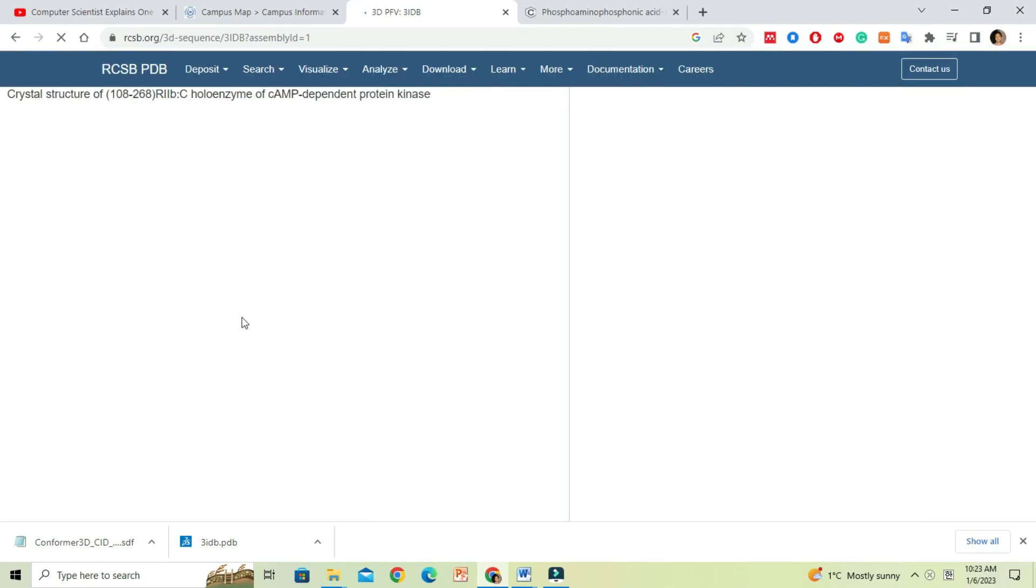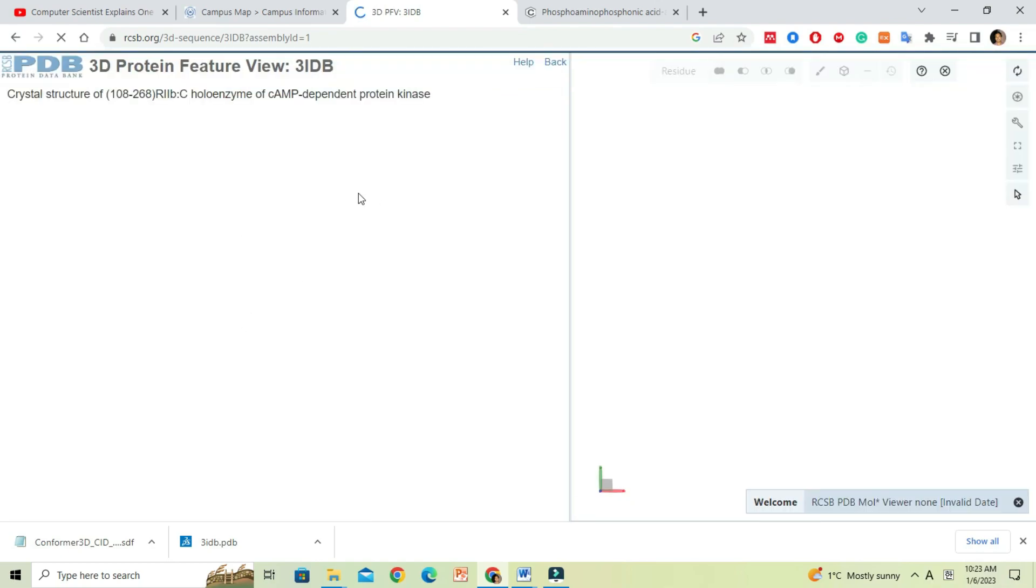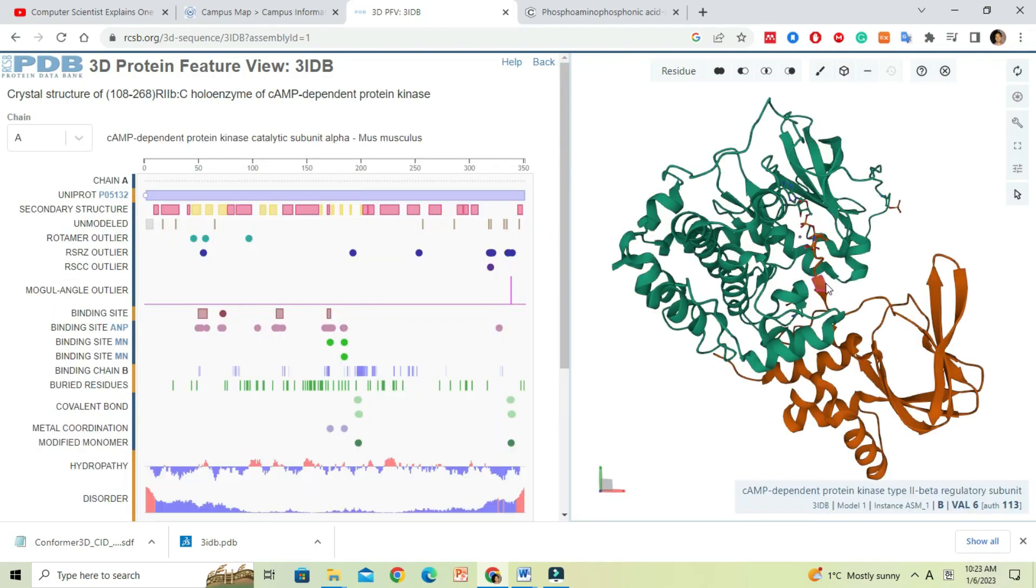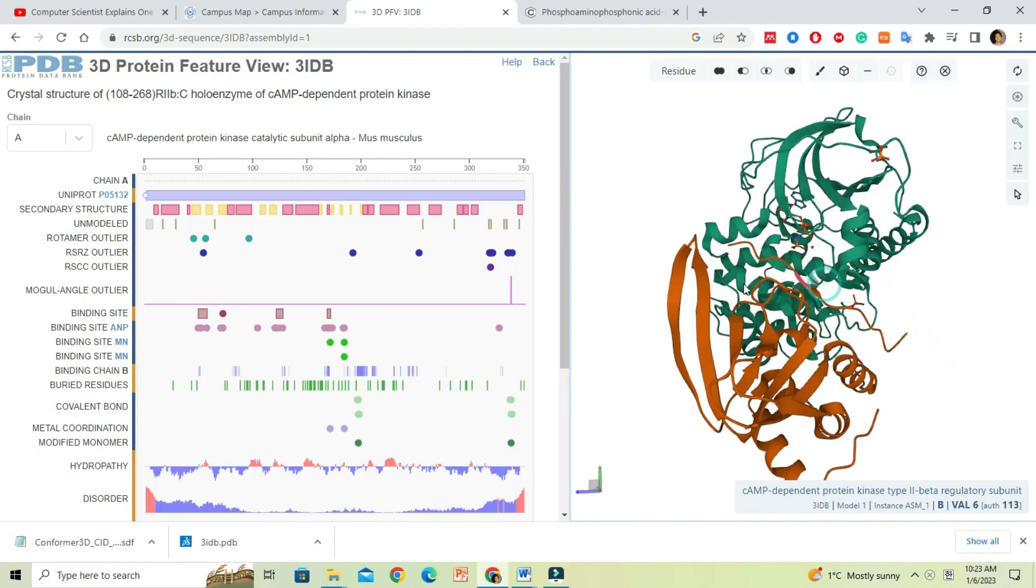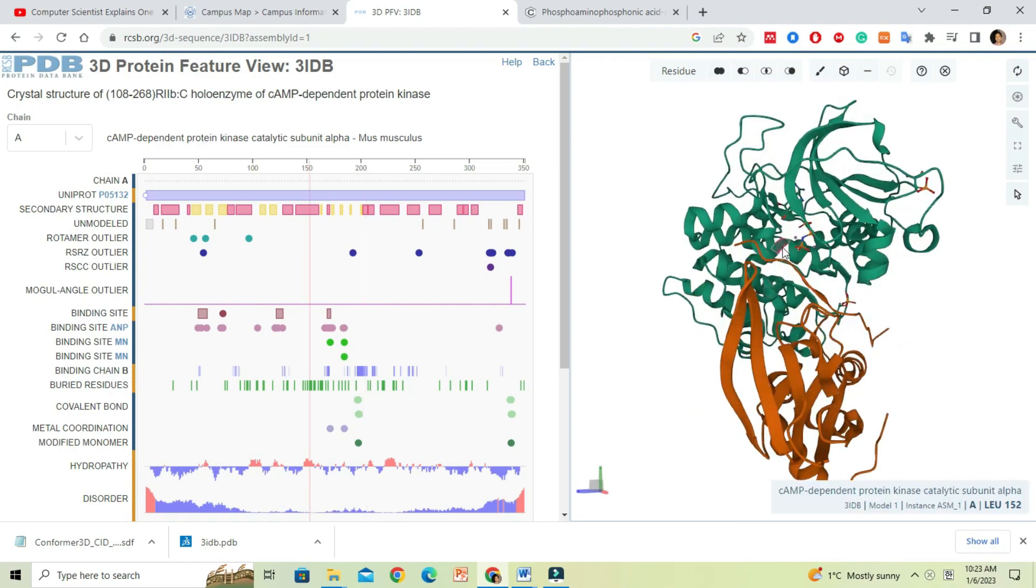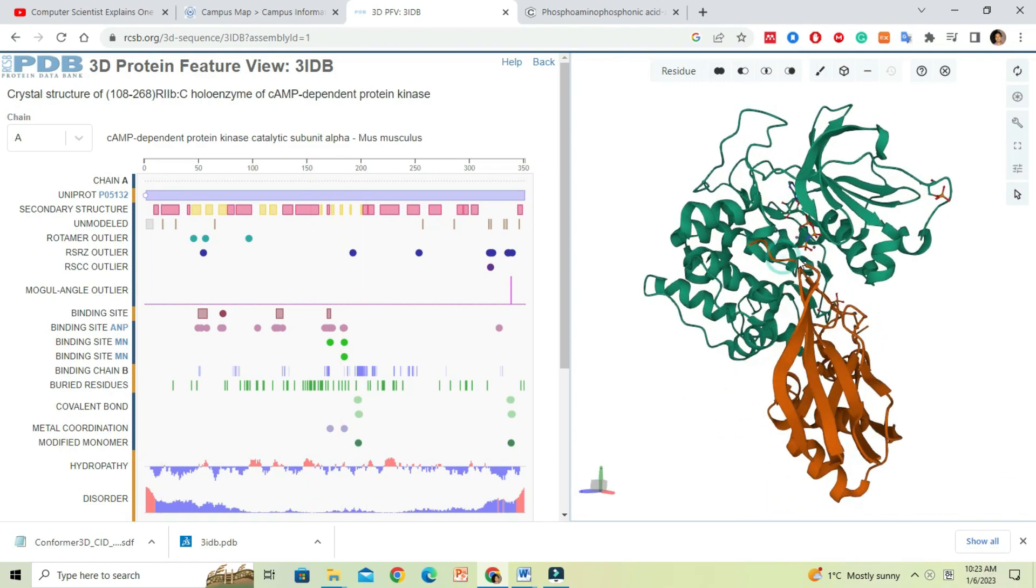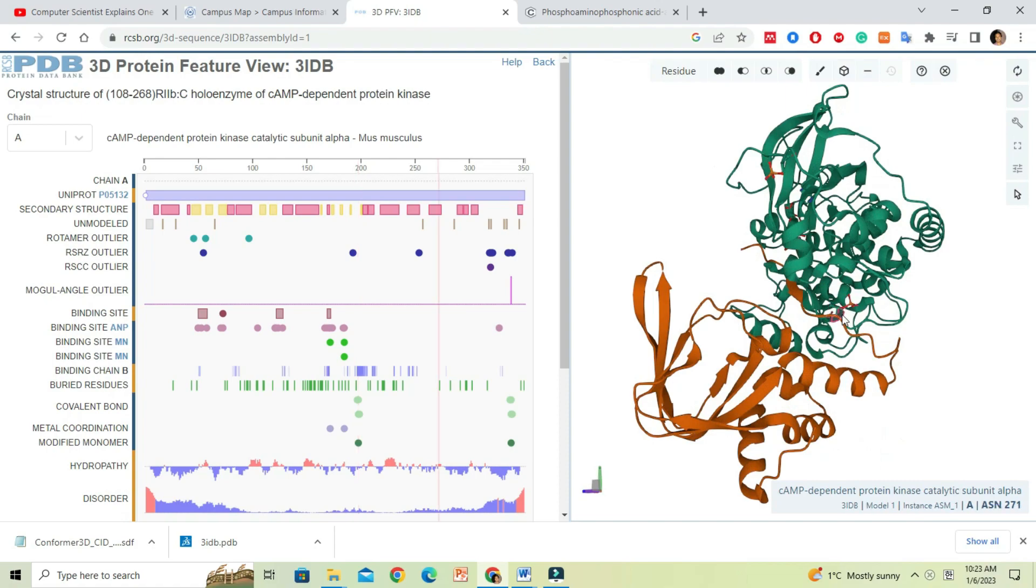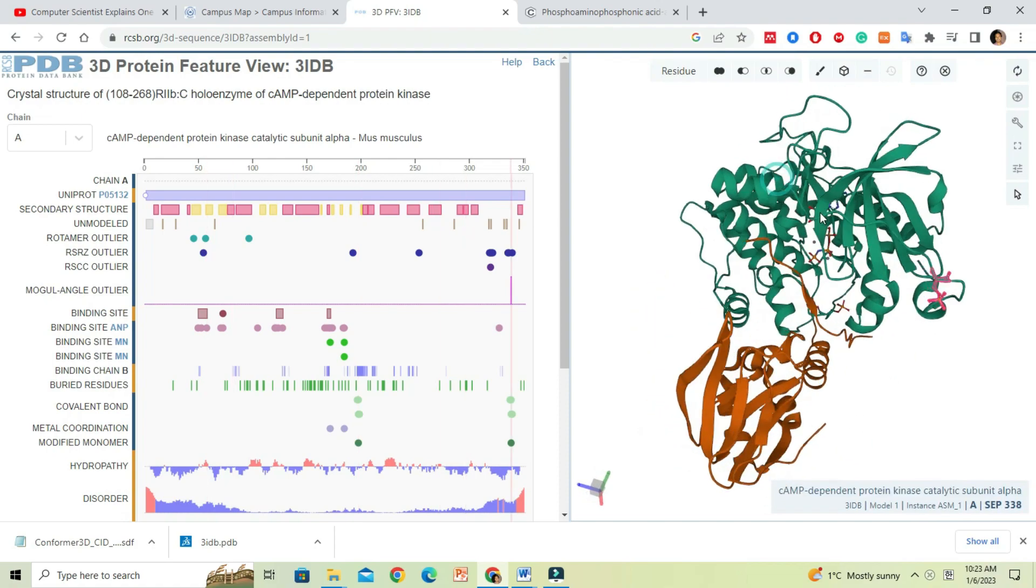Now if we examine the protein structure, you may notice that it contains additional molecules or ligands already attached in the binding pocket. We might require to remove them to take only the protein molecule as a PDB file for downstream analysis.